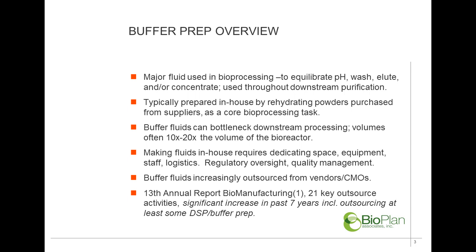Just a very brief one-slide overview of what's going on in buffer prep. As you know, this is a major fluid used in bioprocessing. It's typically prepared in-house by rehydrating powders purchased from suppliers, and it's considered a core bioprocessing task, of course. Buffer fluids, however, can be a major bottleneck, especially in downstream processing. And as we've measured over the last 13 years in one of our annual reports, that impact on downstream processing is becoming increasingly significant.